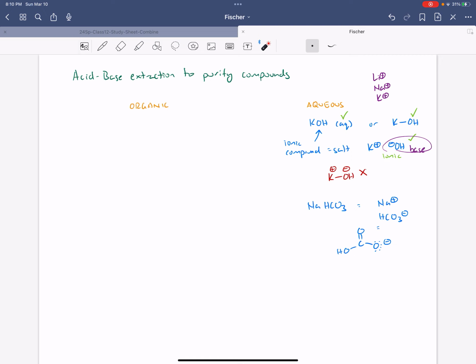And so in your Fischer esterification, I saw your TLC plates. There was an impurity. It was the starting material, unreacted starting material. In the middle here, I'm not going to choose sides just yet, but we have the starting material a little bit, and you have also your product. And all of you had, as far as I can tell from the TLC, a lot of product. OCH3. Give me one second. OH.